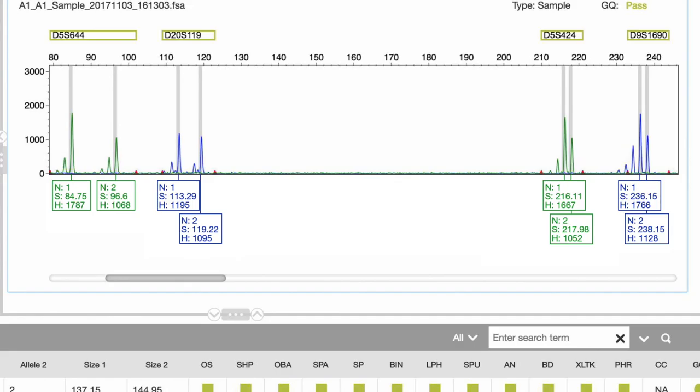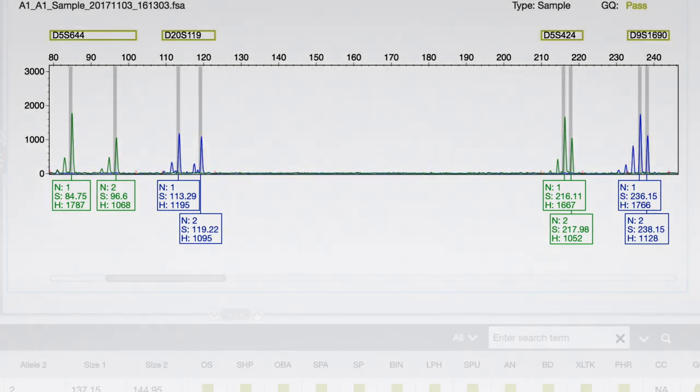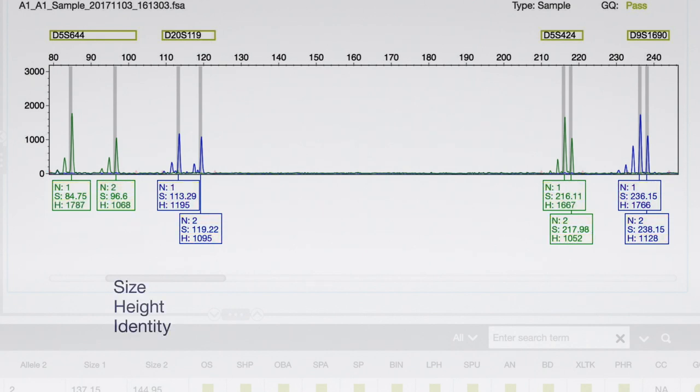This software allows you to detect peaks and label them with metrics like size, height, identity and other information.